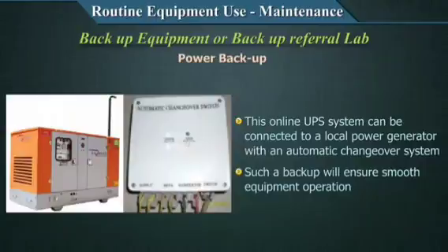To have two kinds of electrical backup that we are talking about. One is a UPS, preferably an online system, and also a generator which is connected to the UPS so that the electricity will continue as far as possible and your services will not be interrupted.